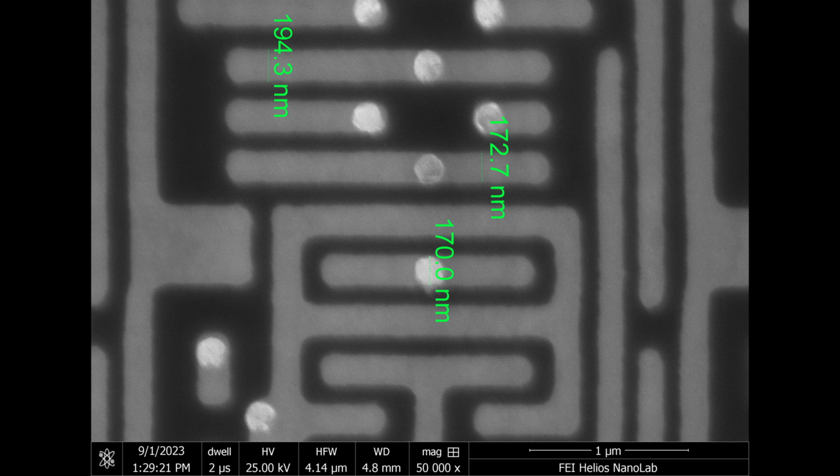For comparison, the diameter of a hydrogen atom is about 0.1 nanometers and a gold atom is about 0.3 nanometers. We are very close to seeing individual atoms, but for true atomic imaging, other types of microscopes are used. I will talk about them in the future.